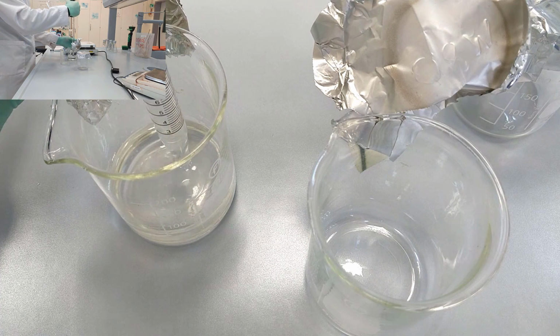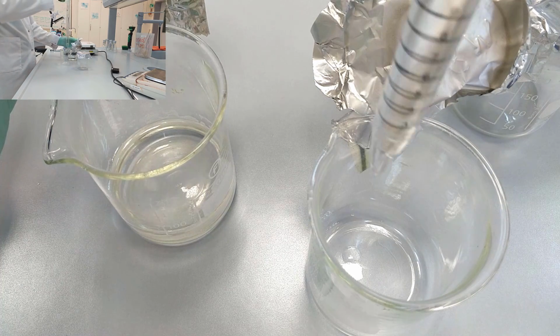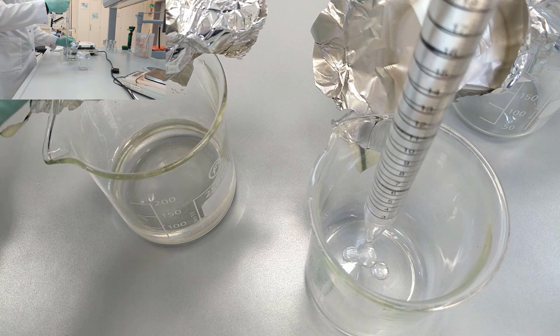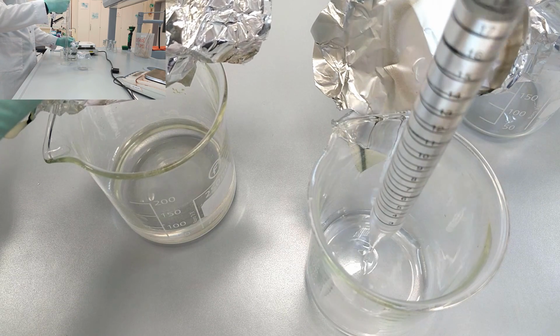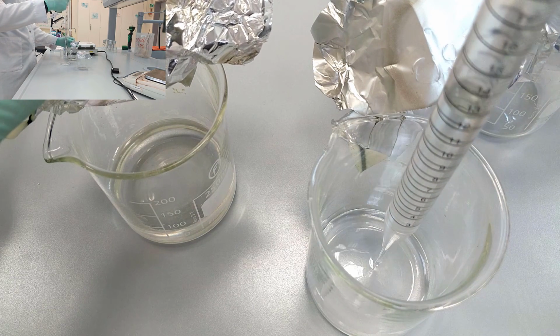When you transfer it to the second beaker, you just press the lower button to release all the liquid inside this pipette.